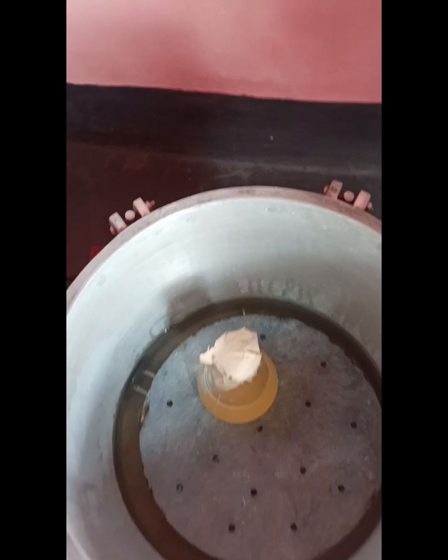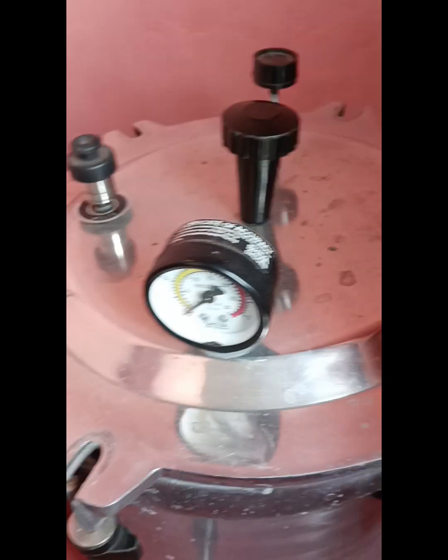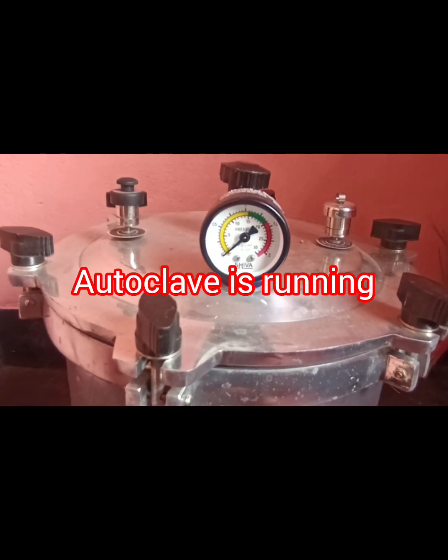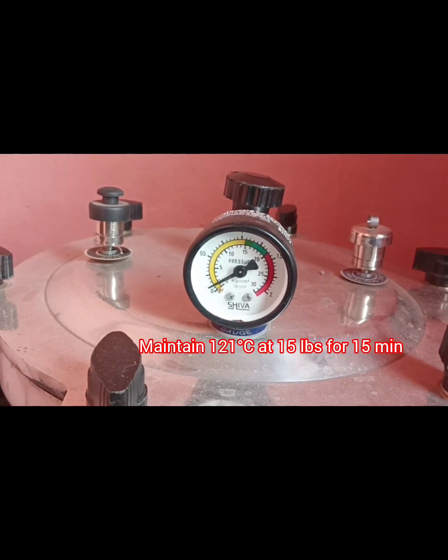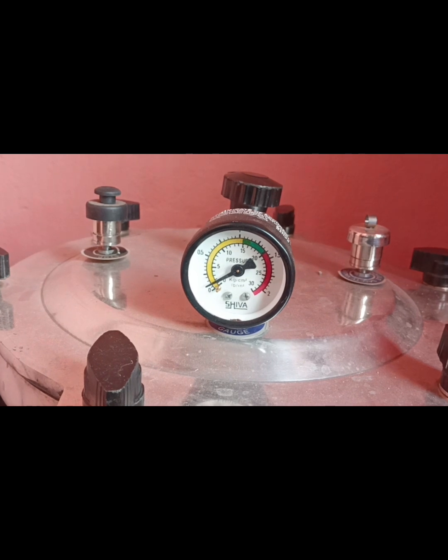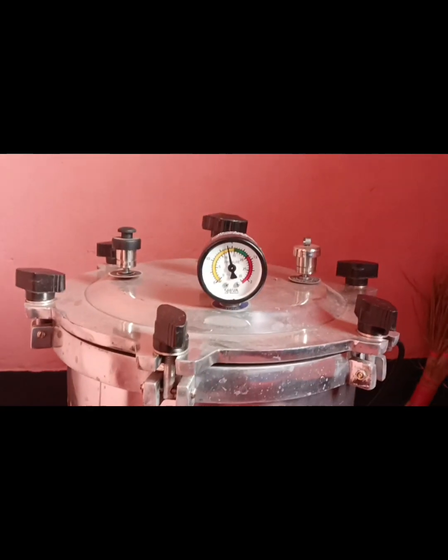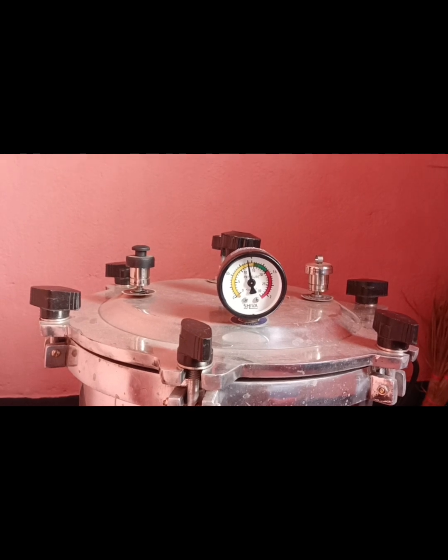After that, place the conical flask inside the autoclave and cover the autoclave lid properly. Now the autoclave process is running, and we have to maintain 121 degrees centigrade and 15 pound pressure for 15 minutes. Now the pressure has reached 121 degrees centigrade, so we maintain it for 15 minutes.